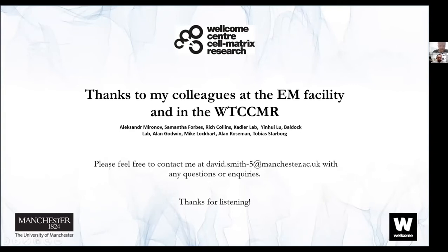Thank you, David. It was a brilliant presentation. It was really interesting. I like the last part because it actually expanded a bit of my knowledge as well. We have not a lot of questions, but one is quite an interesting question from Priya, if I'm correctly saying this name. Sorry for the naive question. How exactly do we differentiate between different cellular components from tomography results, as they are all negatively stained?